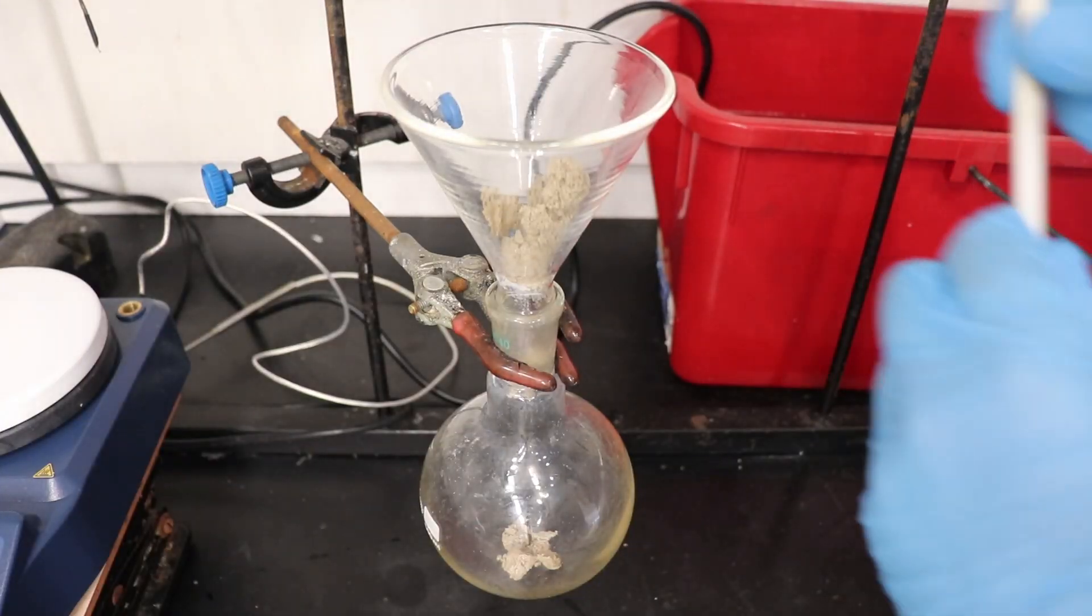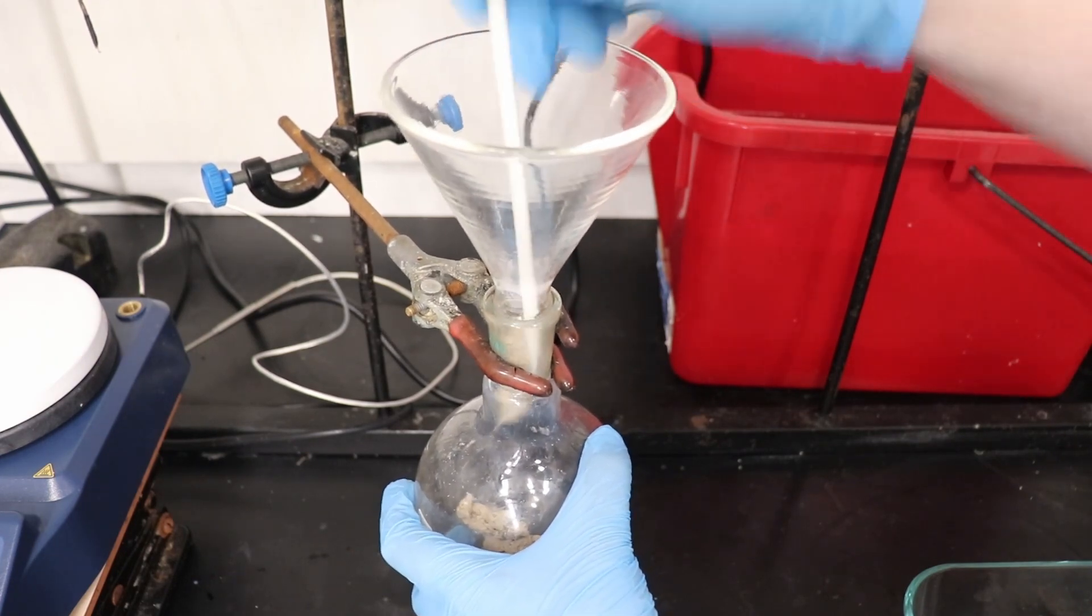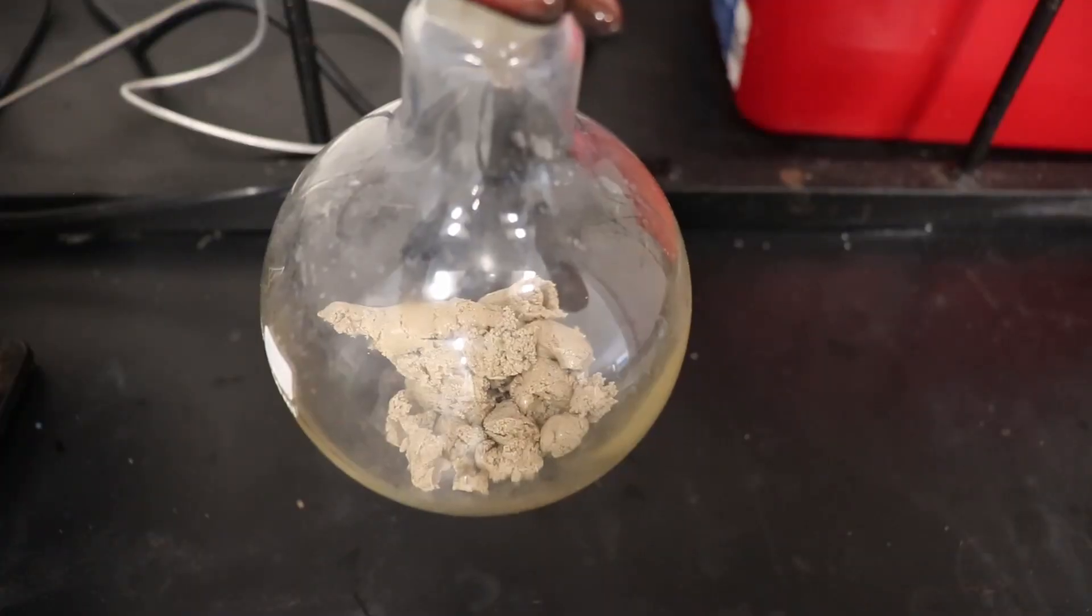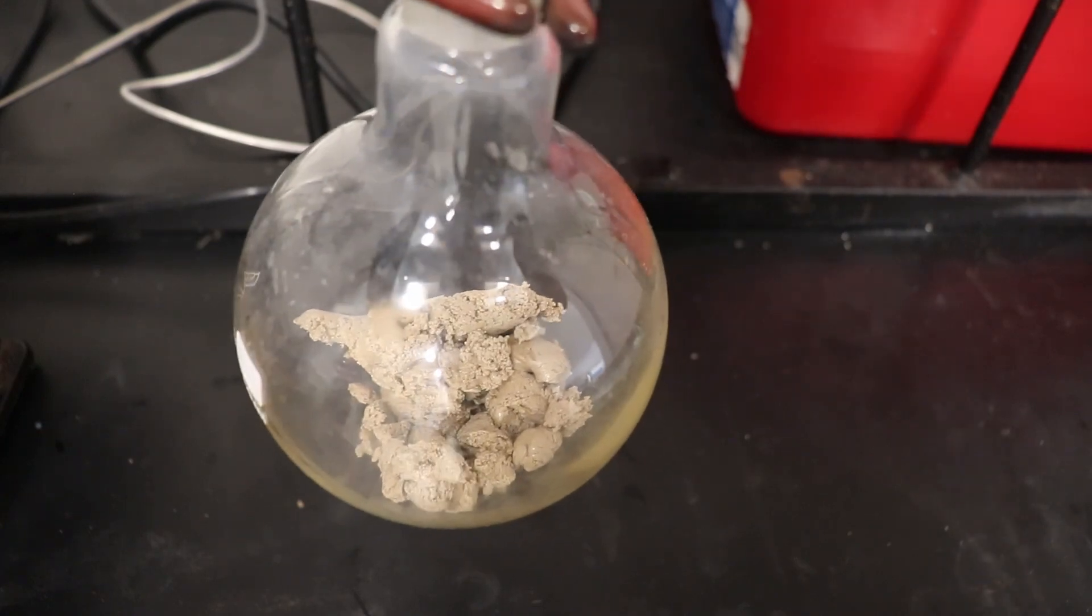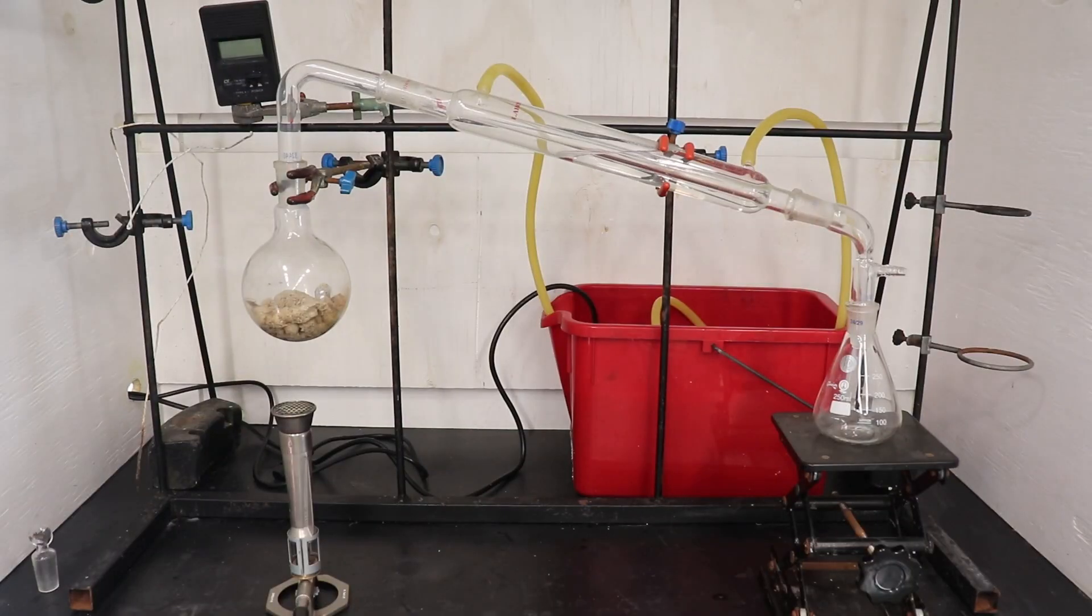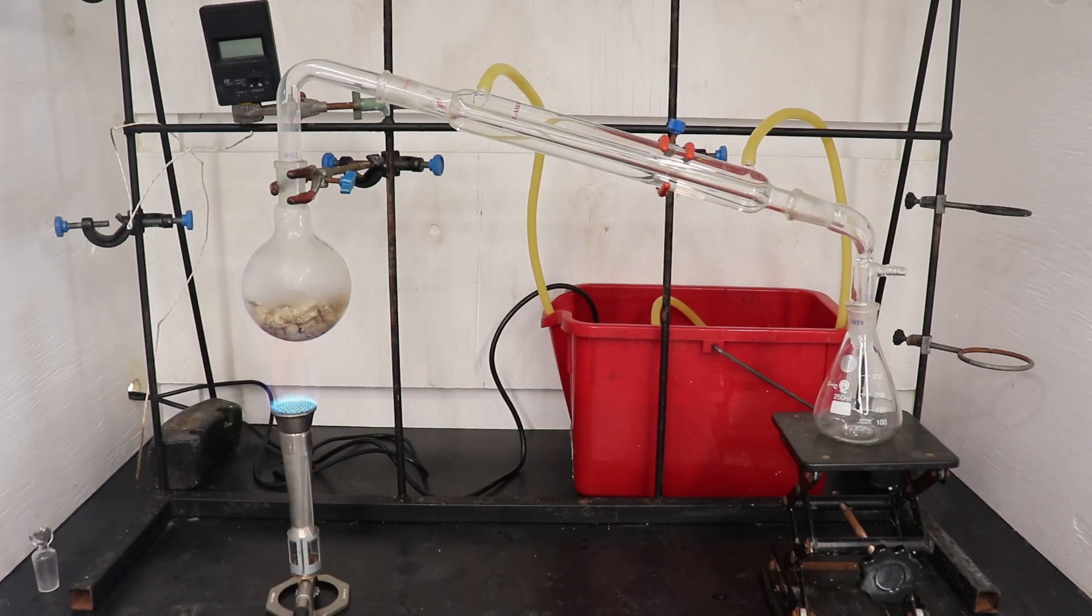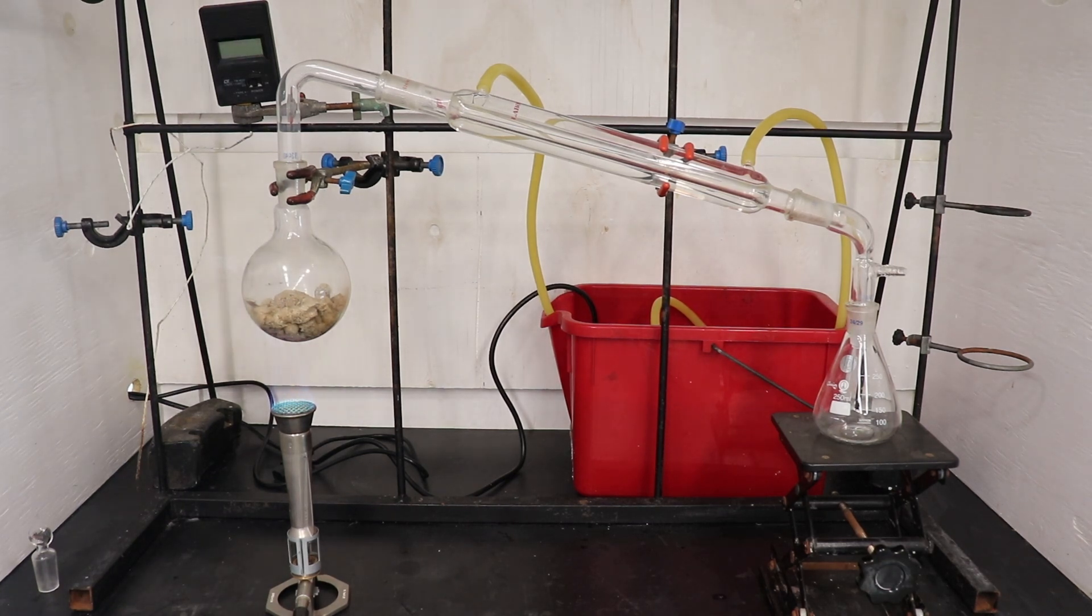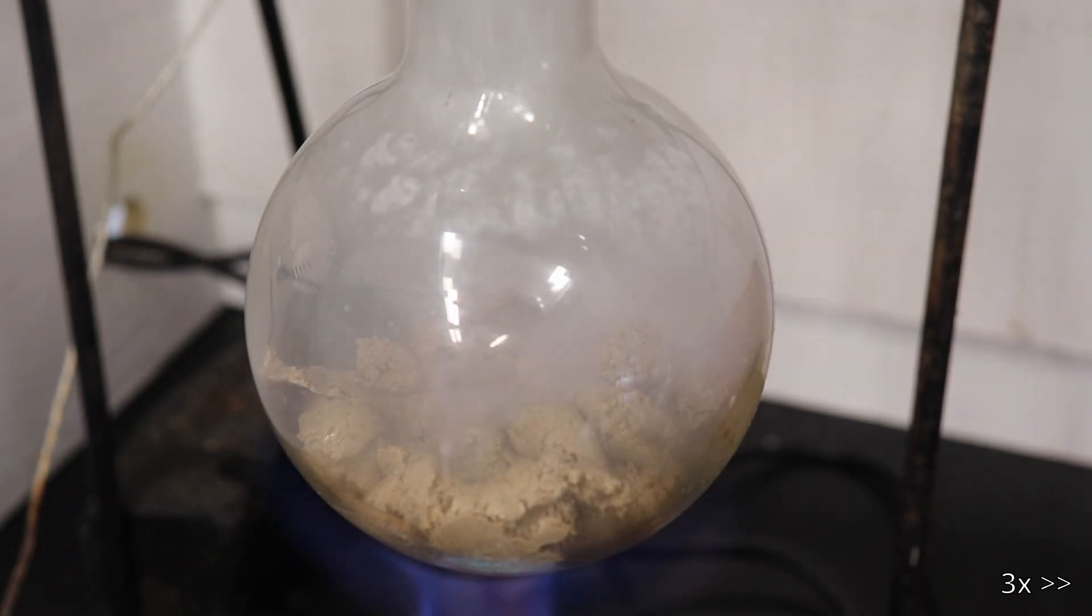This paste was then transferred into a 500ml round-bottom flask and subjected to a strong flame distillation. On the subjection of the morpholine hydrochloride and calcium oxide paste to flame distillation, a thick white smoke quickly formed, followed by a yellow distillate.